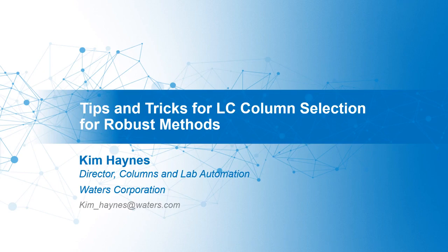I'm going to talk about tips and tricks for column selection to help you develop robust methods.